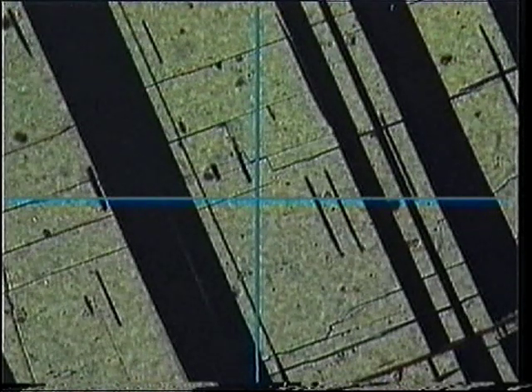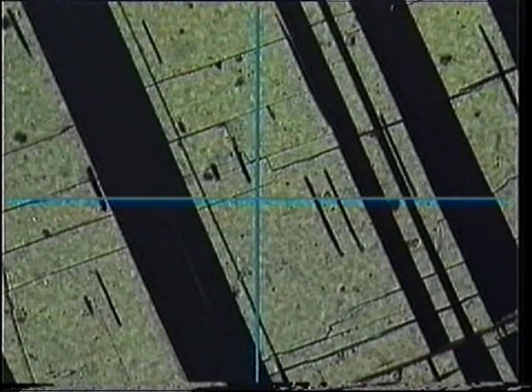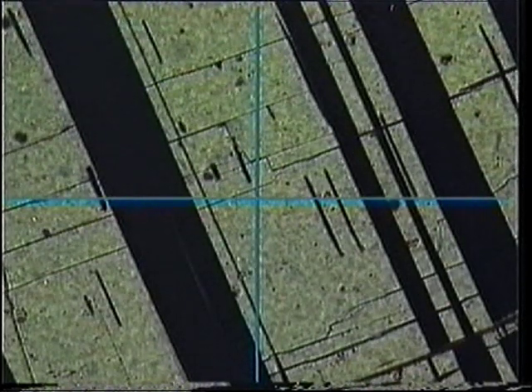Now that we have the right grain, the extinction angle can be measured. Rotate the 010 twin planes parallel to the north-south crosswire. The twins should show the same interference colour in this position. Note the stage reading. Rotate one way until the first set of albite twin lamellae extinguish. Fine-tune that extinction position to get it precisely, and note the stage reading. The difference between the stage readings gives the extinction angle for this set of twins.